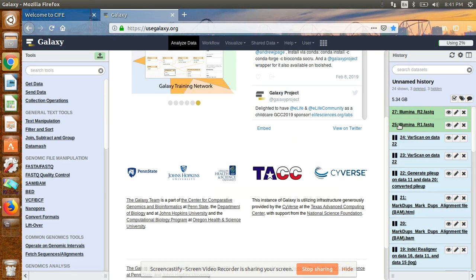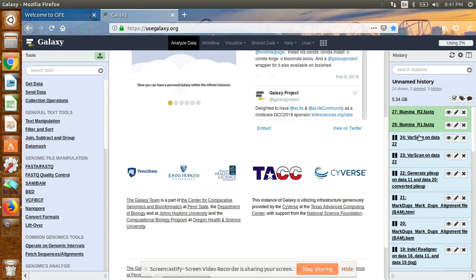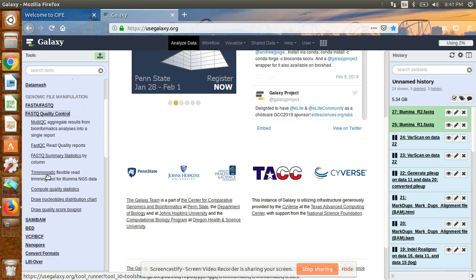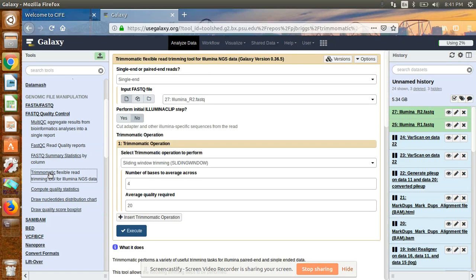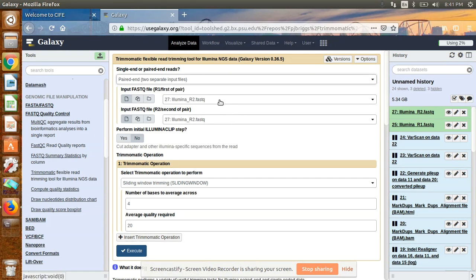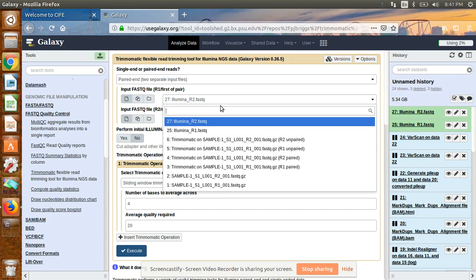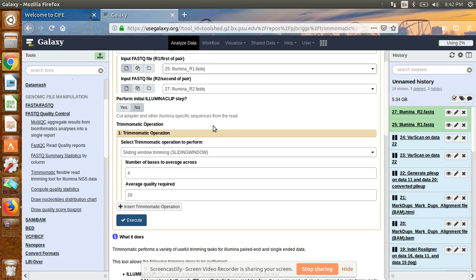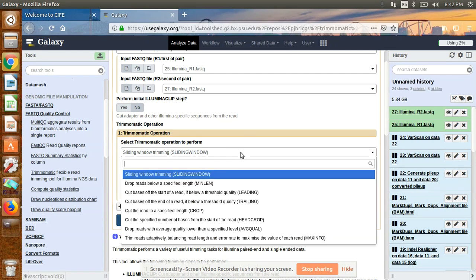You can see we have two uploaded data files: forward R1 and reverse R2. For trimming, go to FastQC Quality Control and select the Trimmomatic tool. Since our sequence is paired-end, select paired. You need to assign the forward sequence and the reverse sequence — R1 as forward and R2 as reverse. The most important thing is setting what parameters you want for trimming your data.